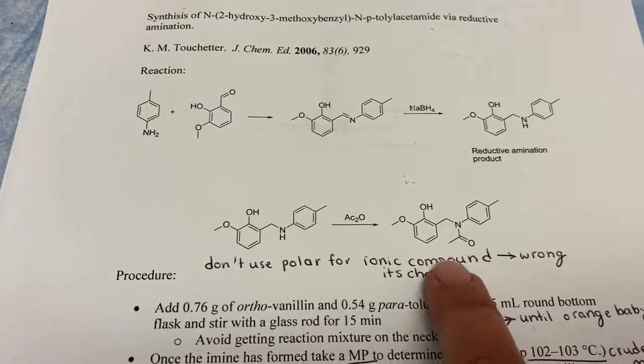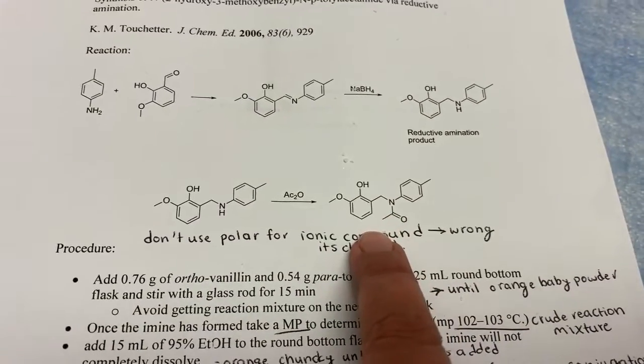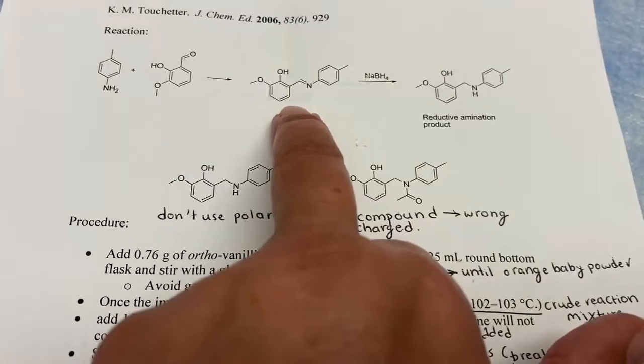Whereas our final product, the amide, we did purify. So we would expect this melting point to be sharp and close to literature value. We would expect the imine melting point to be broad and depressed.